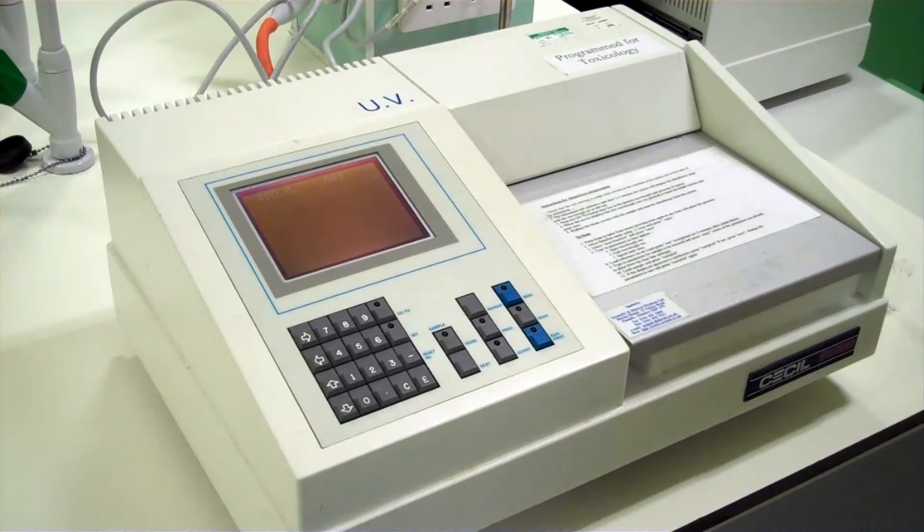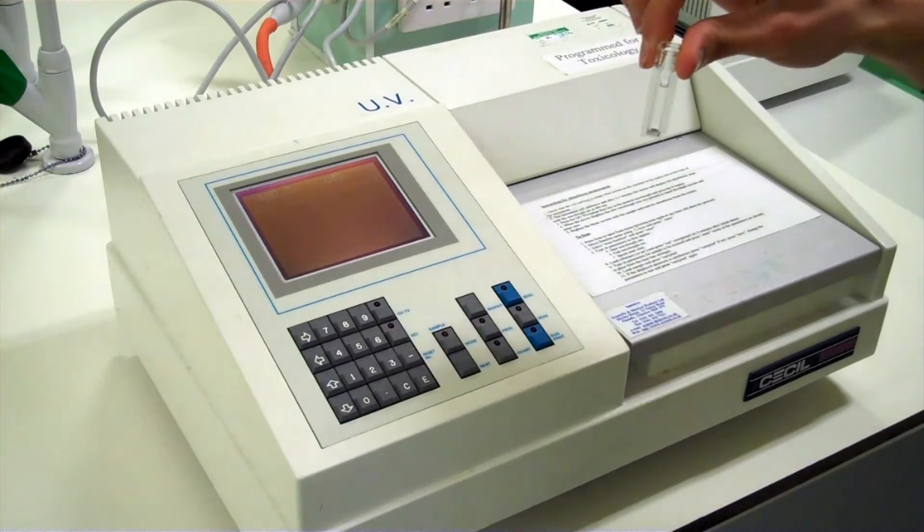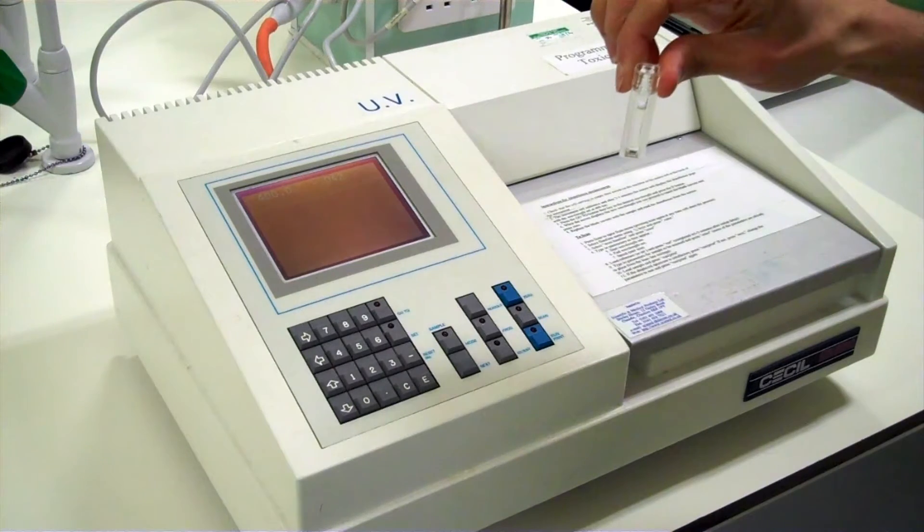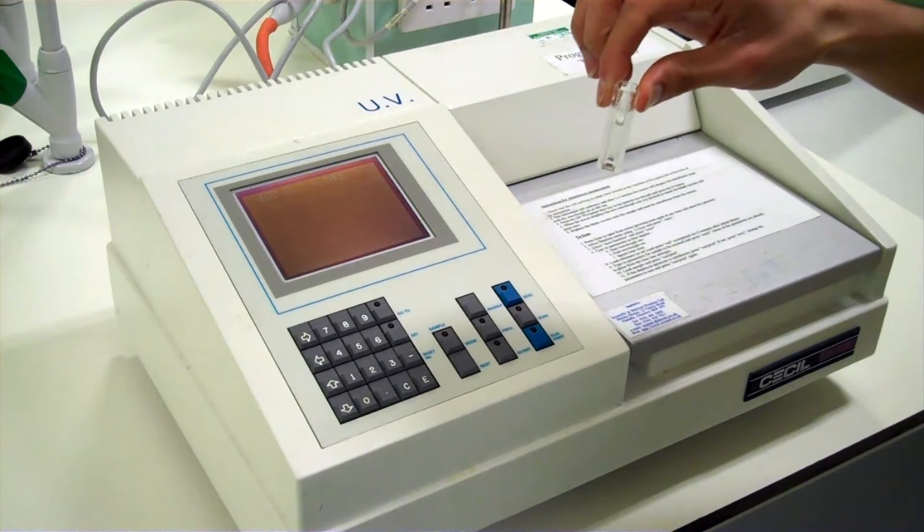To automatically scan a solution at a range of wavelengths we run an automatic scan. We first zero the spectrophotometer using a blank of either water or buffer depending on the solvent we use to dissolve our compound.